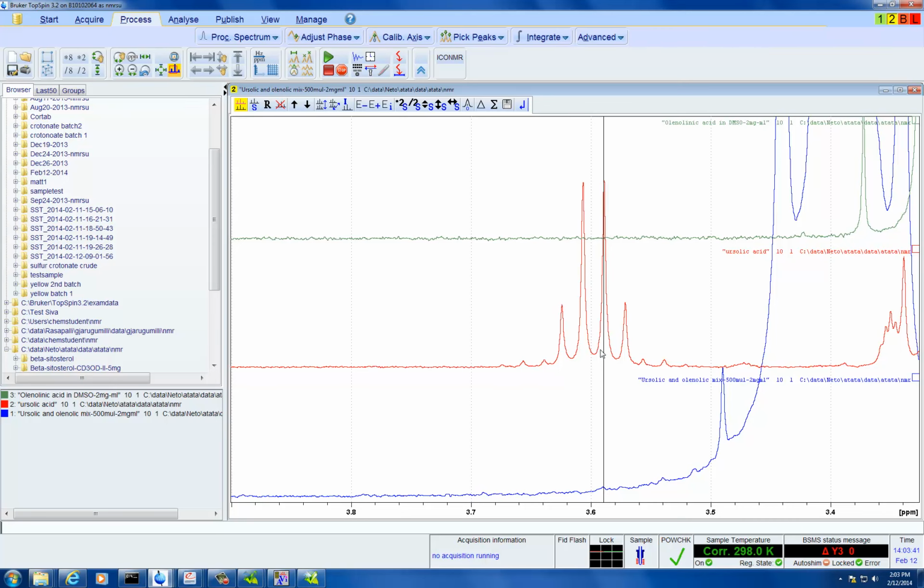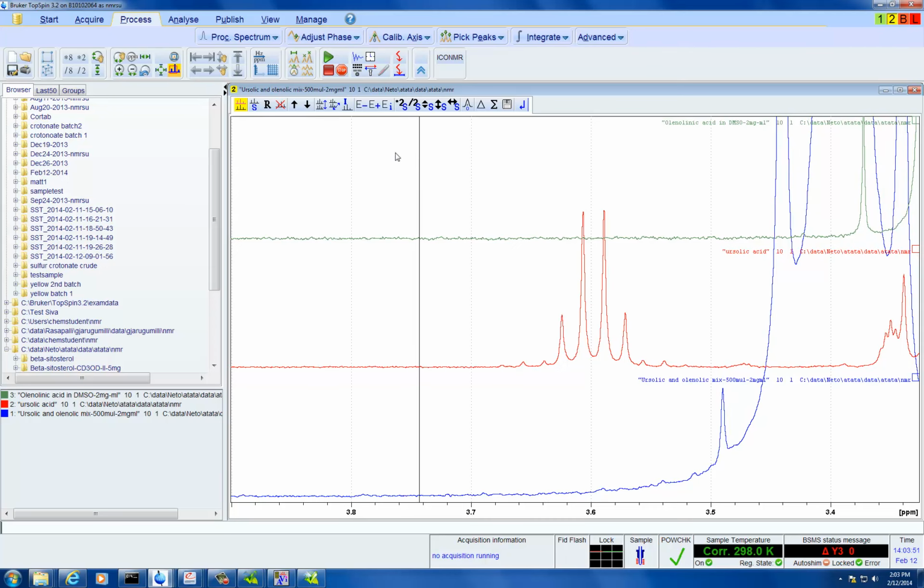So this quartet here you'll quantify. So definitely there is resolution that you could do. So this is actually not that bad. It's quite easy to do. If you have the sample still, we can try to quantify it. We can make a method. So that's not a problem.